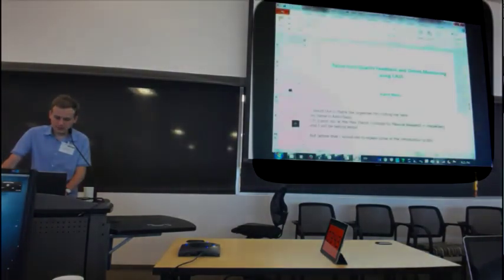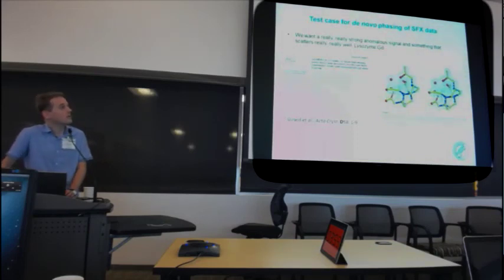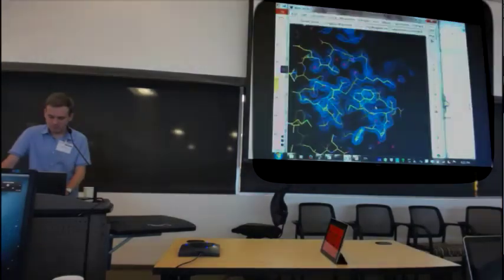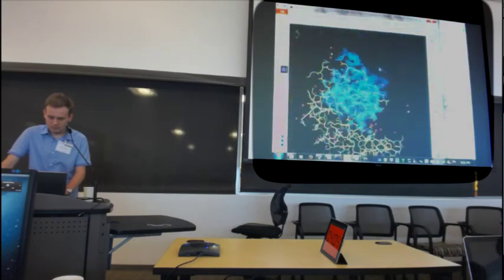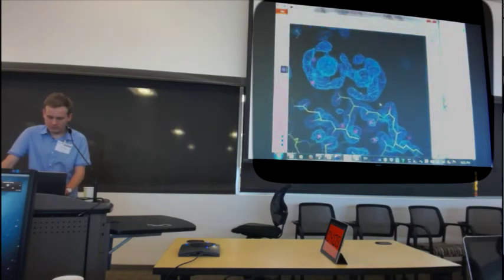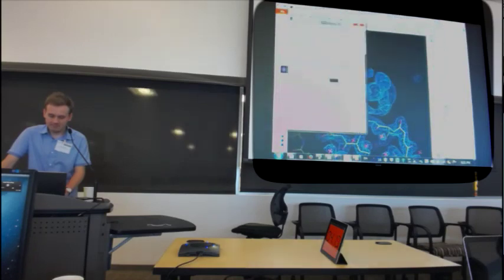Can you put up the symbol? Yes, yes. Because I can see the string. Okay. It's this thing, HPDO3A. That's it. Can you extend the map and the symbol? These two gadolinium sites, what's on the other side? Can you put on the symbol? Sure.